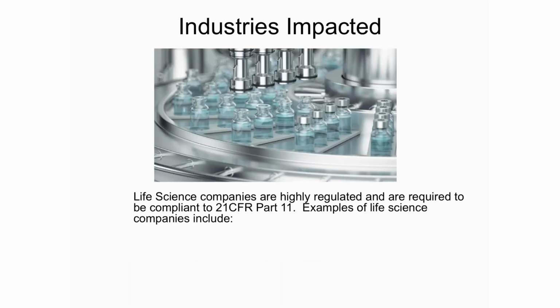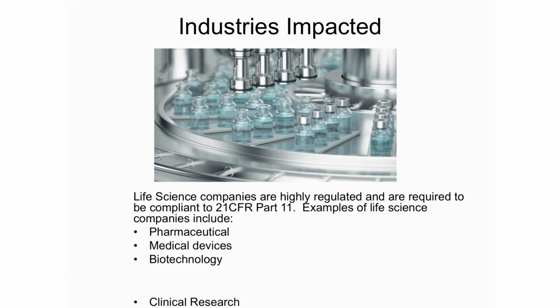Industries impacted include life science companies, since they are highly regulated and are required to be compliant to 21 CFR Part 11. Examples of life science companies include pharmaceutical, medical devices, biotechnology, and clinical research.